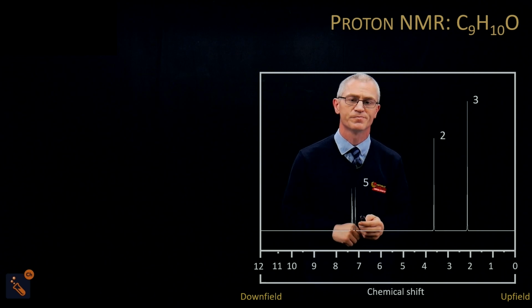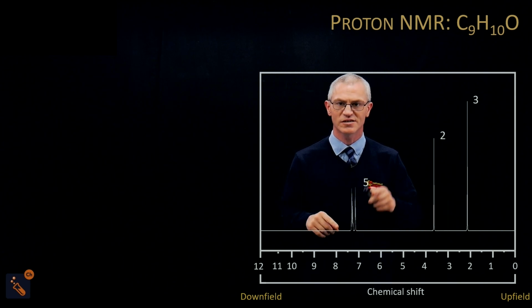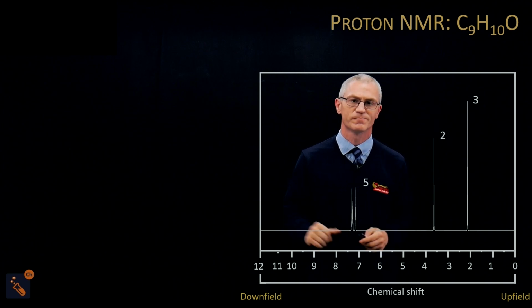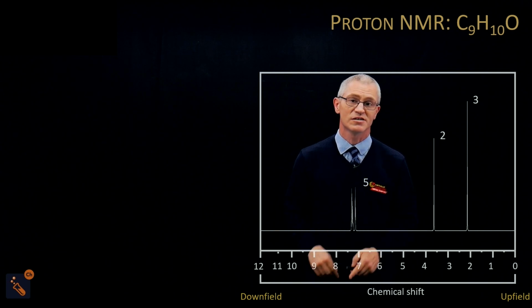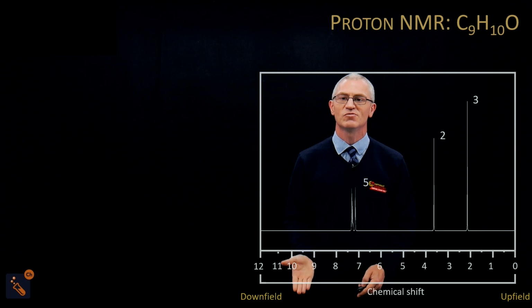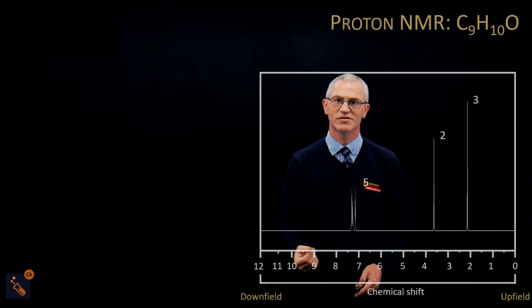One of them is an alcohol. So if we look here, can you see a singlet with a 1 anywhere here? That's an alcohol, a singlet with a 1. No, I can't. So there's no alcohol. The other one that contains 1 oxygen is aldehyde. On your data sheet, hopefully you're looking at a data sheet now, you can see between 9 and 10 is your aldehyde peak. Can you see something between 9 and 10? No. Actually one of the best things about NMR is to eliminate what is not there first. So we know no aldehyde, no alcohol.